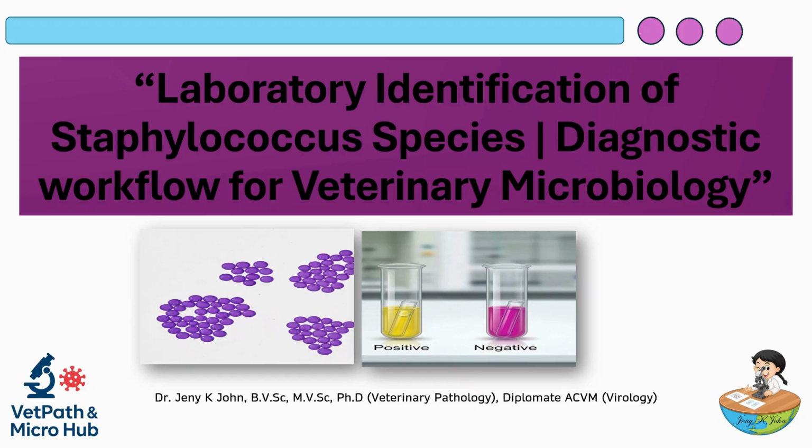In this lesson, we will explore the key biochemical tests and characteristics that allow us to distinguish between different Staphylococcus species, that is coagulase positive and coagulase negative, and we will learn about other tests like VP test, trehalose fermentation, hyaluronidase, and beta galactosidase. By the end of this section, you will be able to systematically identify Staphylococcus species based on their biochemical profile and understand their relevance in both clinical and veterinary microbiology.